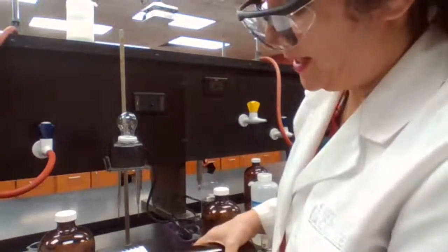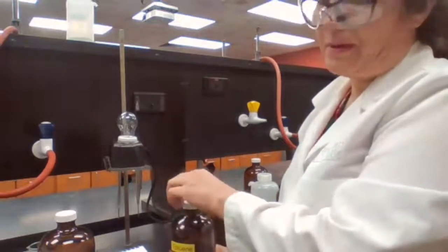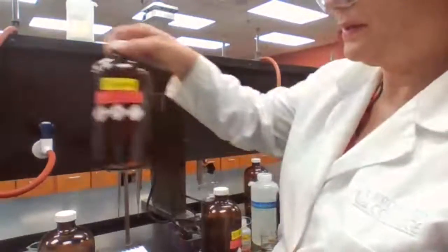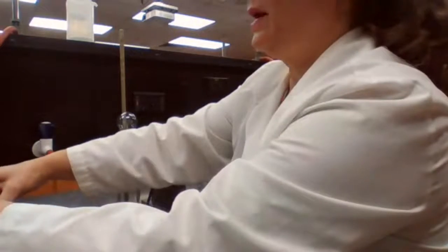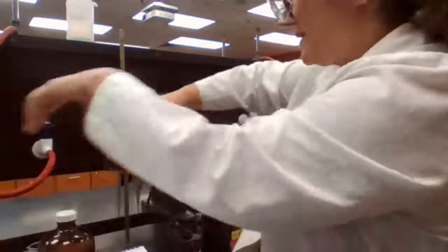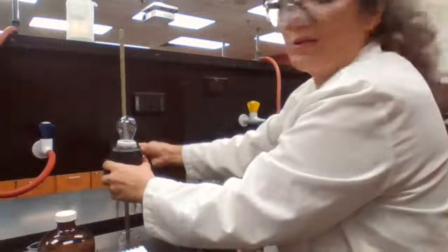What do you expect from toluene? Is it electrolyte or non-electrolyte? With the explanation that I gave you, it's a molecular compound. It doesn't have ions, so I gave you the answer already. Because it doesn't have ions as a molecular compound, it's not going to be an electrolyte.